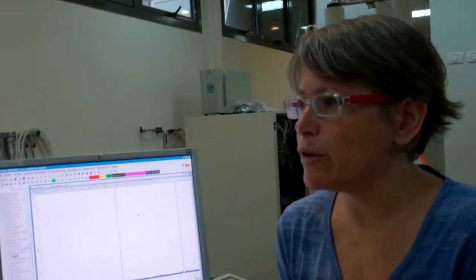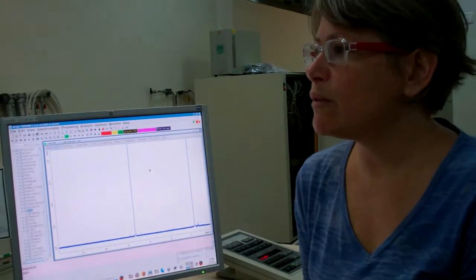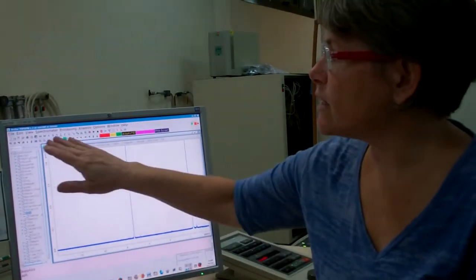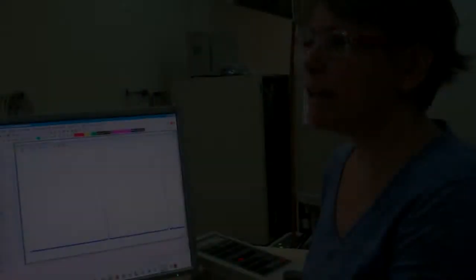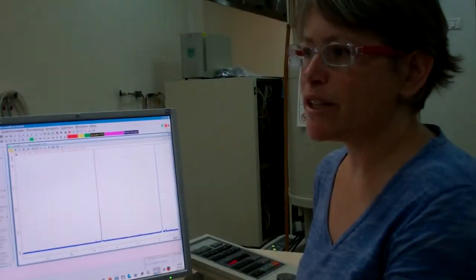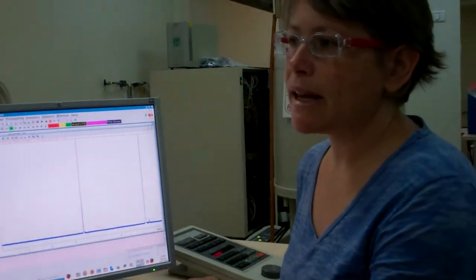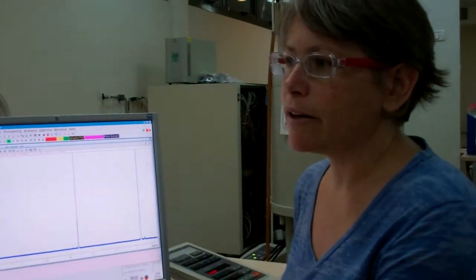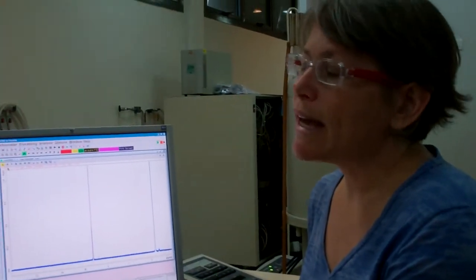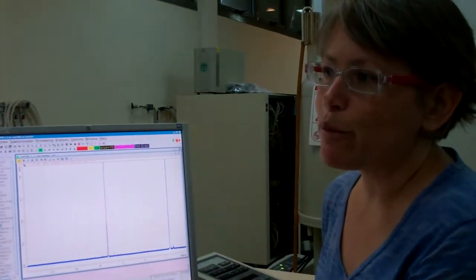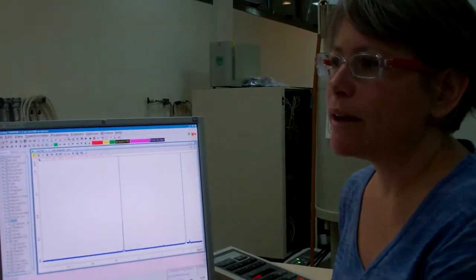If we're still not satisfied, we can go into the interactive phase correction mode with the first of these five processing buttons here. We know that we're in phase correction mode since we have this yellow icon here. We can't go into another mode until we leave this one.